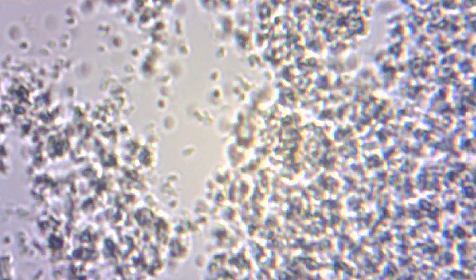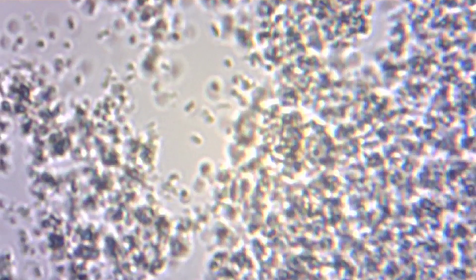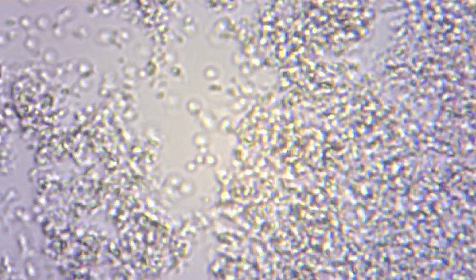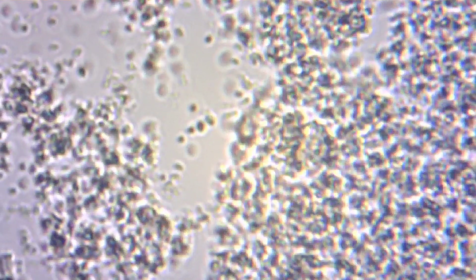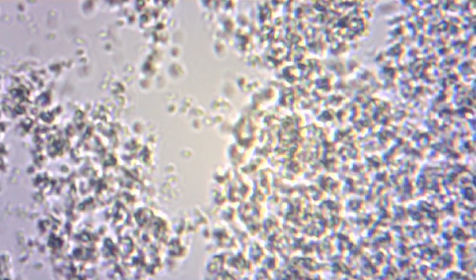What you see moving on the screen there is lactobacillus, and those are about maybe two microns in size — so about a thousand times smaller than a grain of rice. This is what's in your yogurt; this is the bacteria that is good for you.